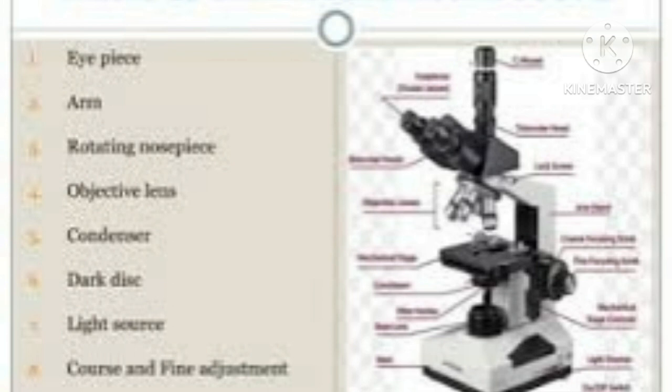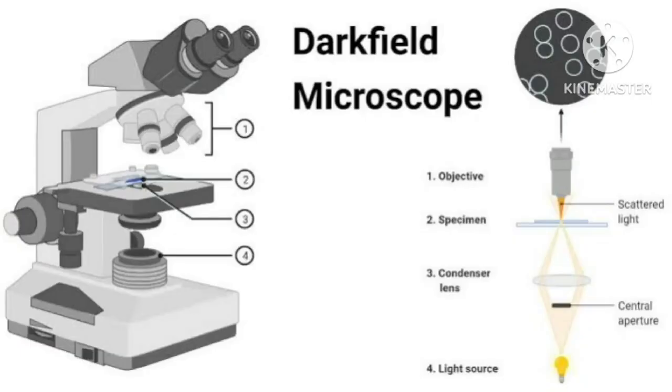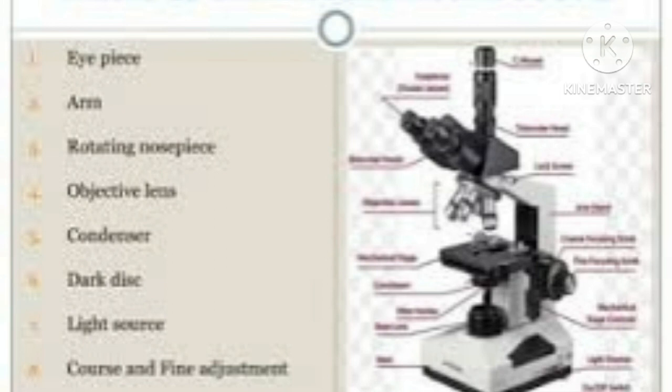Thank you. We will see first the applications of Darkfield microscopy here. The first one is suspension of cells and samples of pond water that look spectacular under Darkfield microscopy. Next application includes it is particularly valuable for examination of microbes in unstained condition. This technique is useful for diagnostic significance, that is diagnostic detection of syphilis.